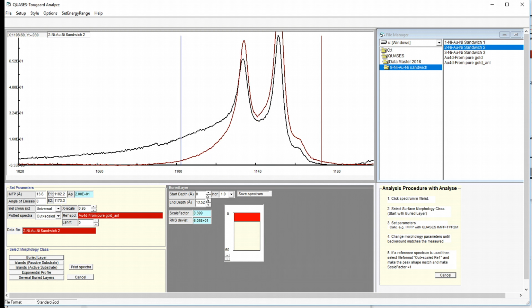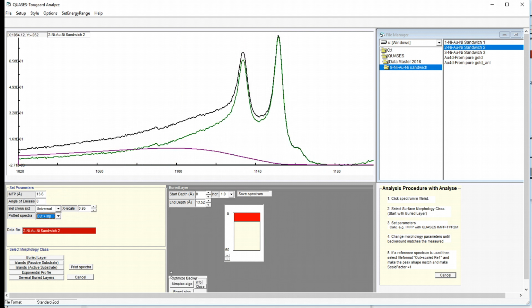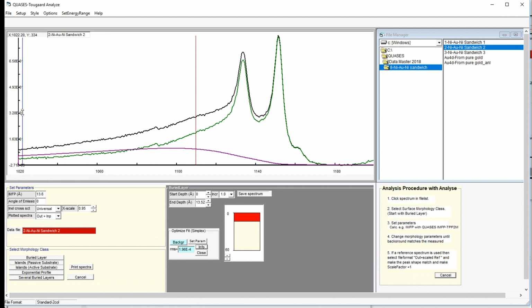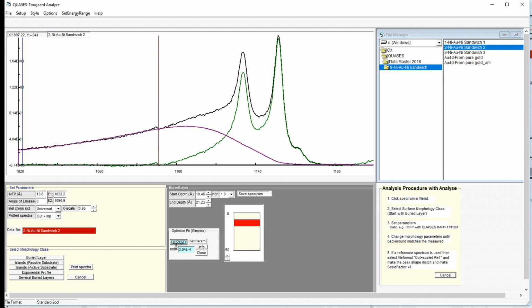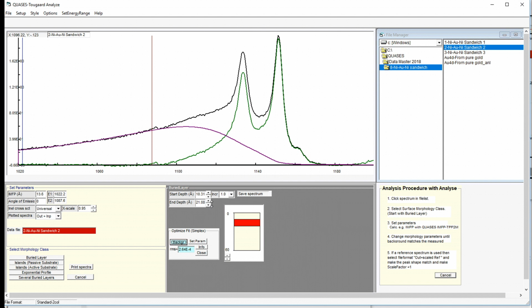We could do that. Yes, we could do it. Maybe remember what we had, or we can also go to output plus input here and take the simplex. So we take the simplex algorithm, move out here, and see what we get. We hit background here, and we get about 10 to 20 angstroms. And now again, we compare to the reference spectrum.